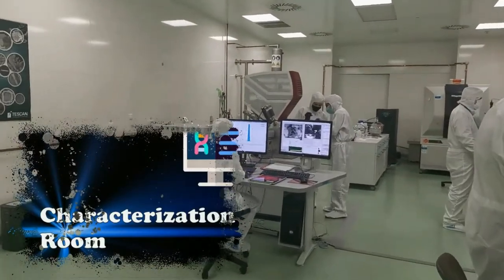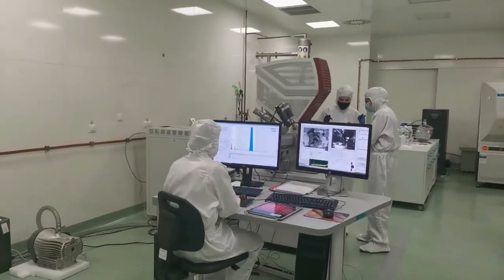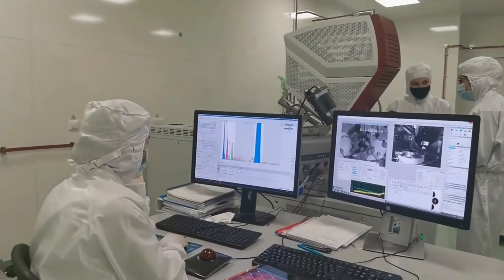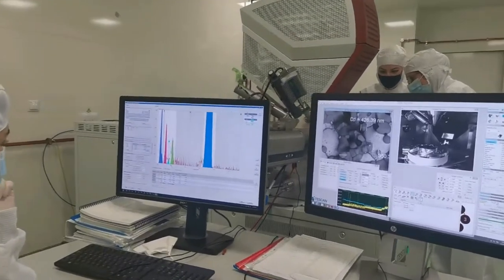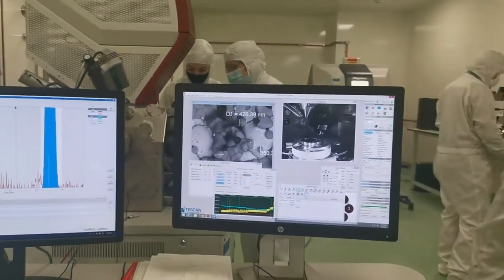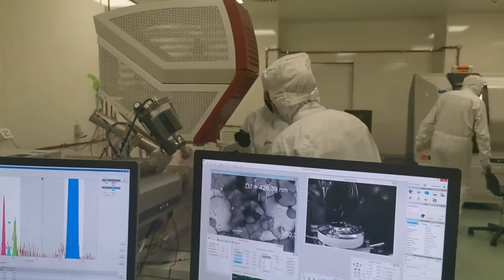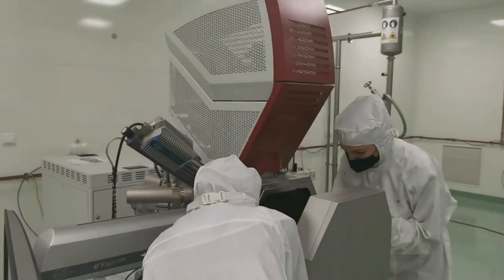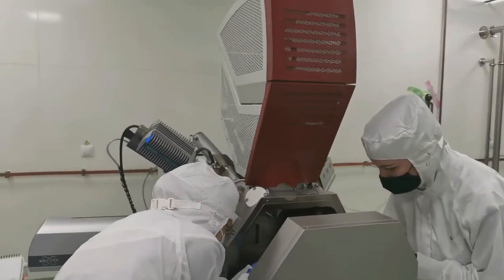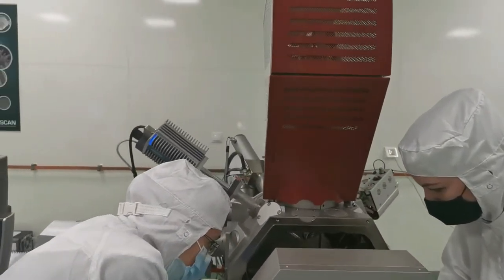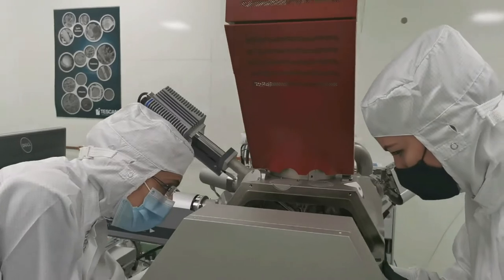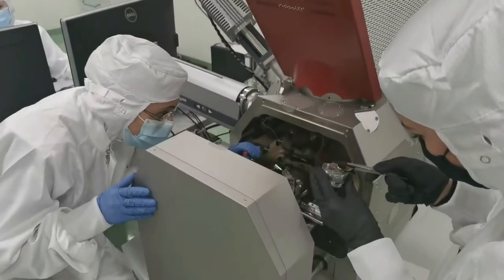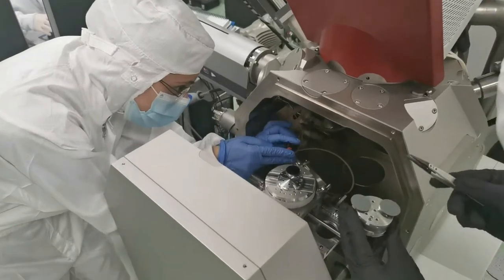The characterization room is dedicated to the analysis and examination of the obtained targets. Here, several equipment are available. First of them, the scanning electron microscope is supplied with an energy dispersive X-ray spectrometer for the elemental analysis and an electron backscatter diffraction detector for crystallographic characterization. The SEM is equipped with an electron beam lithography tool for nano- and microstructuring of the surface of the targets.